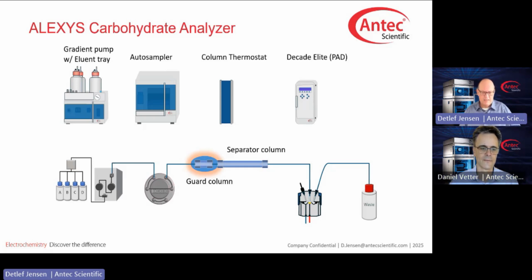And the guard column has it in its name, guard, to protect. And what does a guard column protect? It protects the separator column. So anything that comes in with a sample that might harm the separator column sticks on the guard column first.